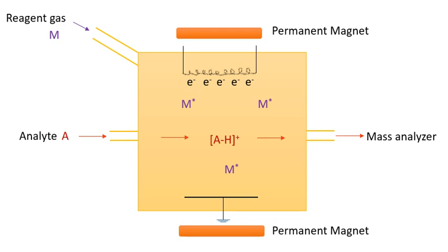In cases where very low limits of detection are needed, environmental toxic substances such as halogenated species, oxidizing and alkylating agents are frequently analyzed using an electron capture detector coupled to a gas chromatograph. Negative ions are formed by resonance capture of a near thermal energy electron, dissociative capture of a low energy electron, and via ion molecular interactions such as proton transfer, charge transfer, and hydride transfer.